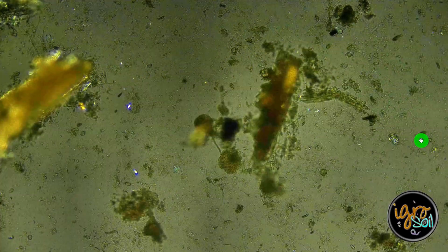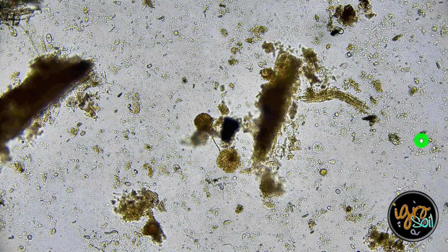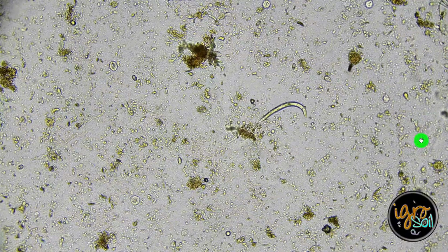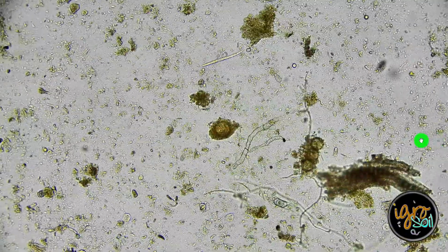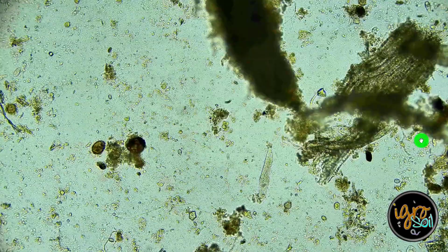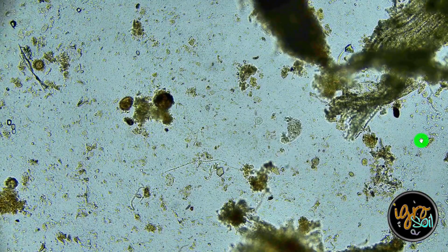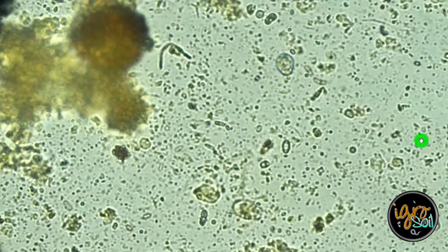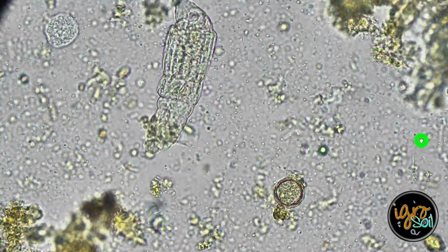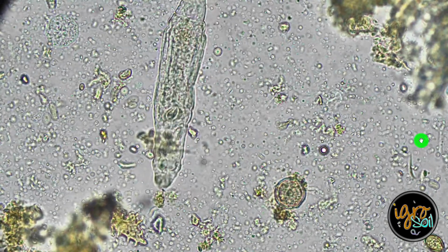Anyway. Okay, well, I think we've spent enough time here. I hope that people get out of this what I got out of it. That at the end of the day, these mushroom blocks are wicked. There's two more nematodes that I'm looking at. I haven't even made it to the other side of the slide. So look at this rotifer. Chill. Let's see if we can get a better picture. It looks a little different.